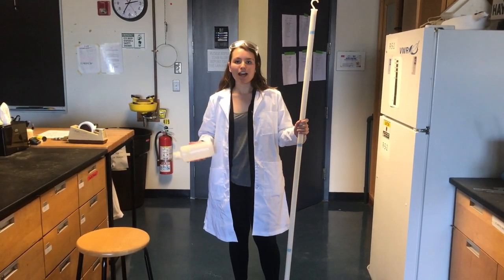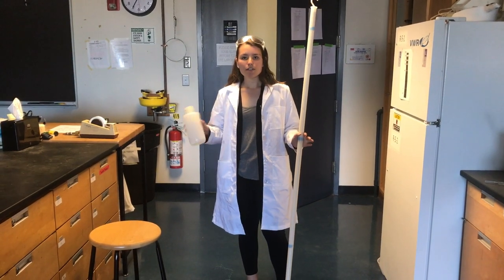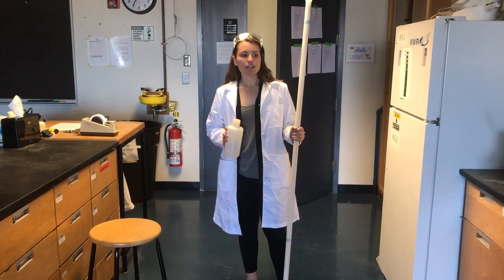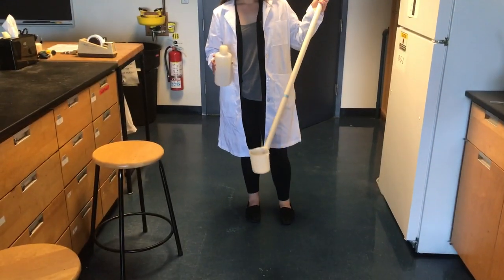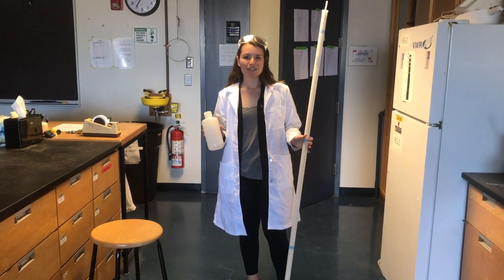Hey everyone, welcome to the last week of lab. This week we're going to be going down to the Muddy River. One person in your group is going to stay here and make the chemicals, and one person is going to take this long stick with the cup at the end and this plastic bottle and fill it with Muddy River water.